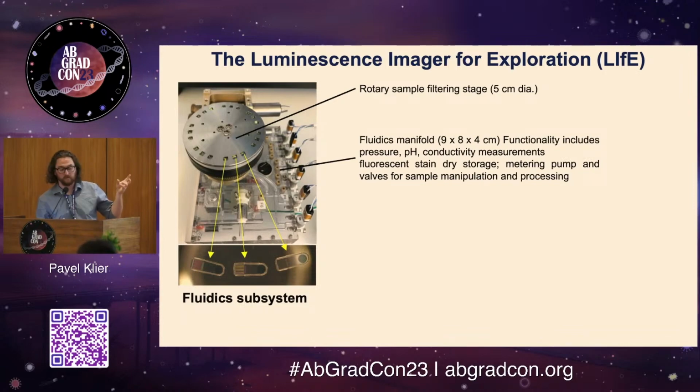It's also attached to the fluidics manifold, which is the part that actually moves all of the liquids and fluids around. It also has a lot of sensors for pressure, pH, conductivity, and crucially some storage for the fluorescent stains that I'm going to be talking about a little bit later in the talk.